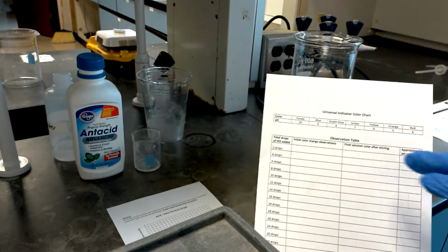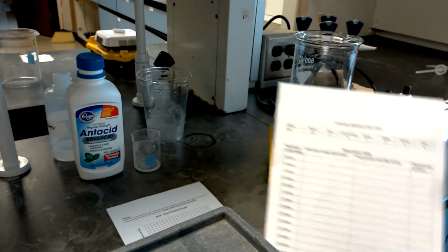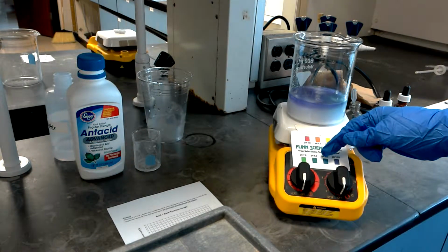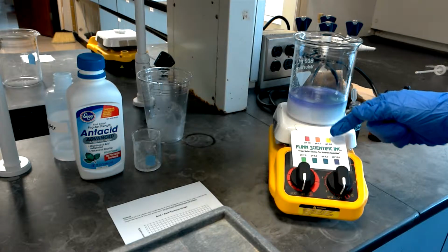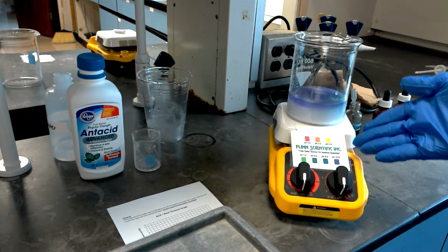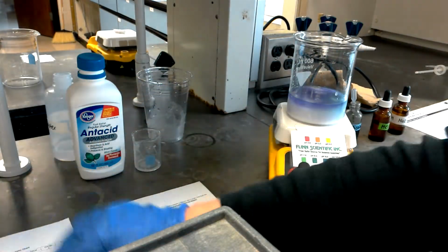These colors are important because you're going to take the color that you record and approximate a pH value based on this chart. So if it's closer to purple than blue, you would choose a pH closer to 10. When you get down here, if it's closer to orange than it is to yellow, then you might put 5.2 as your pH. But really, it's a number that you're going to approximate based on the color that you observe.